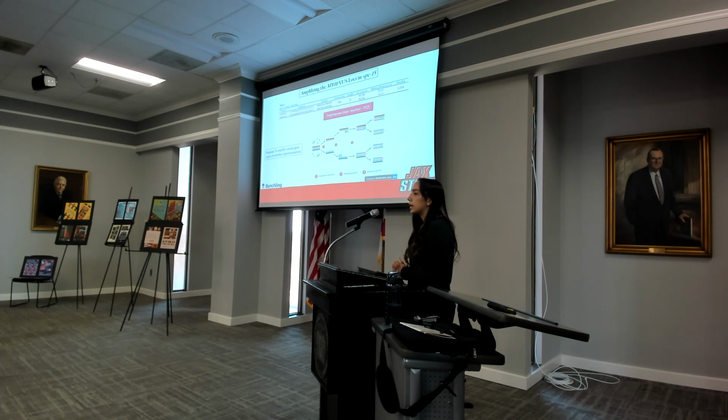For PCR, I used Benchling to create my own primers. I created 5 sets, and the one you see at the top of the screen is the set that I chose to use. It has the lowest penalty score. And this was done to amplify the variant gene region for use in further experimentation.